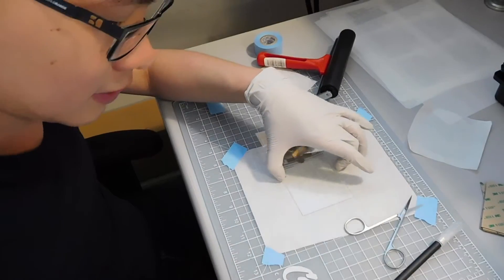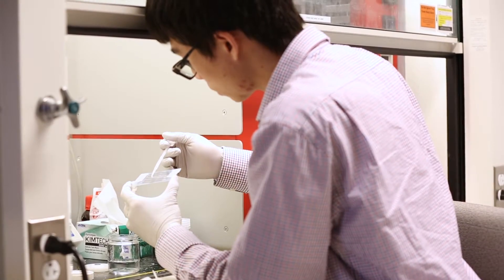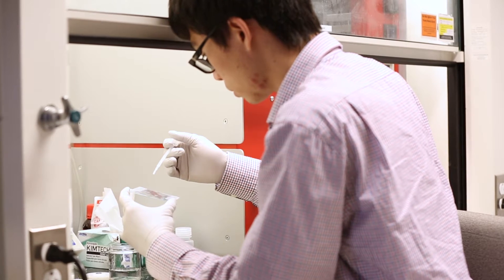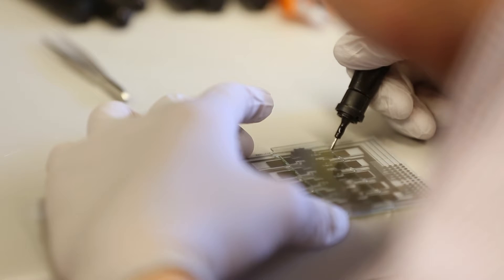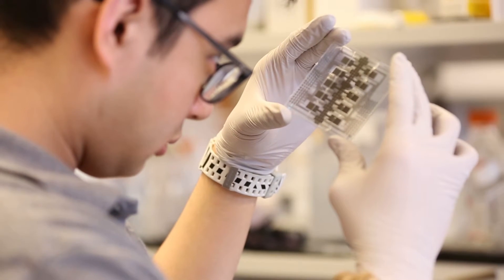We apply them to glass slides that have adhesive on them, and once we have that, we process them some more and put some coatings on them to make them ready for digital microfluidics. Then we have the top plate, which is the counter electrode to the bottom electrodes, and we mate the two together and you have a device that's ready to go.